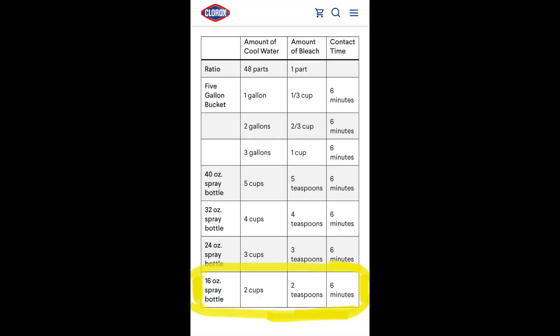For that test, I followed Clorox's recommendations, which was to make a spray solution with two cups of water and two teaspoons of bleach, spray the area, and let it sit for six minutes. I had many viewers comment that they don't wait six minutes, they'll just spray and wipe or maybe wait a minute, and many people asked me to consider testing different wait times.